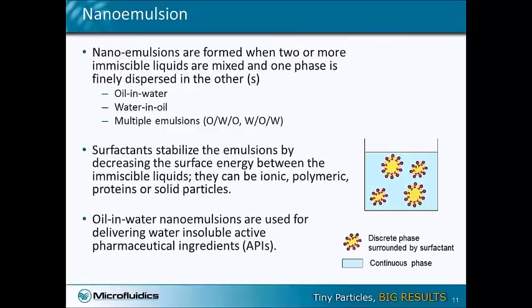Surfactant is generally used when formulating emulsions because the newly created nano-sized droplets need to be stabilized to prevent them from recoalescing back into large particles. There's a variety of surfactants available for selection.